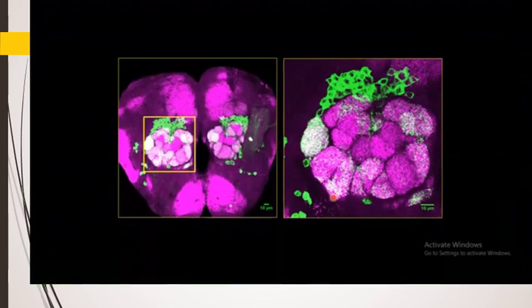Now for example, here is the image at 40x. Once we add a 3x digital zoom, you can clearly see the image quality has improved and the resolution also looks way better.